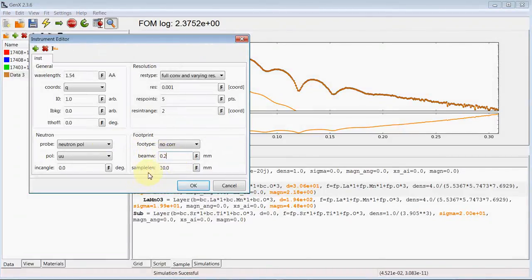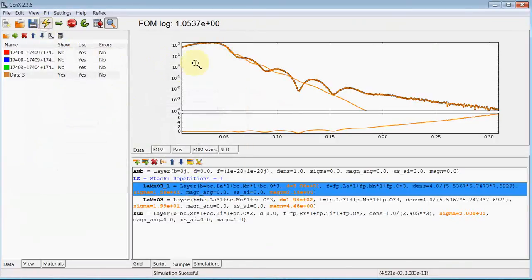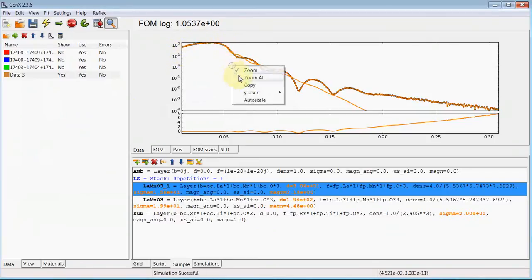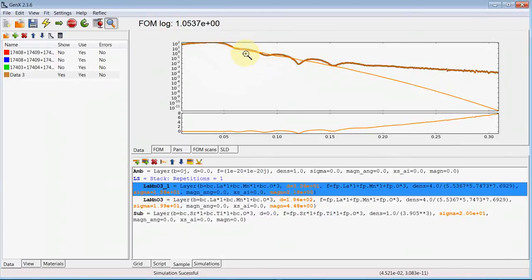If we simulate now you see the total reflection already fits, the footprint correction works correctly, but we see our model has a far too thick layer and the intensity drops too fast for higher Q, which means that our surface roughness is too large.